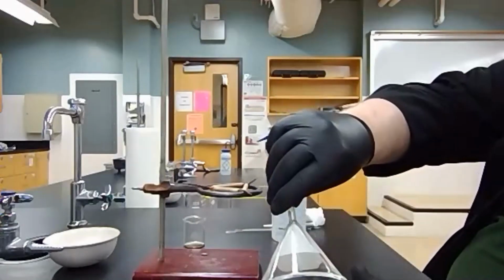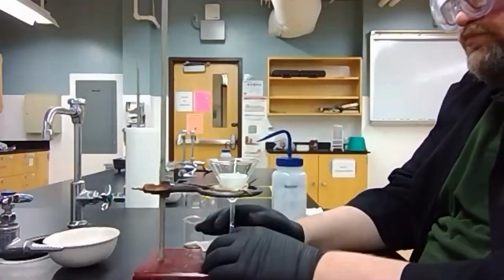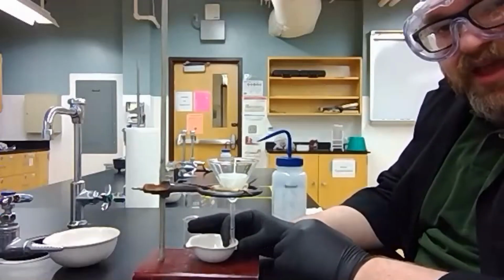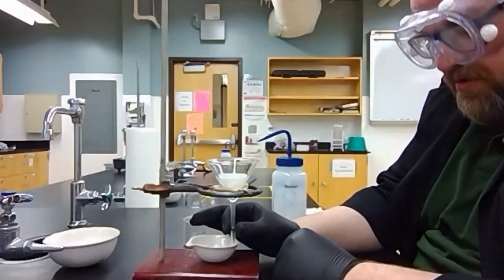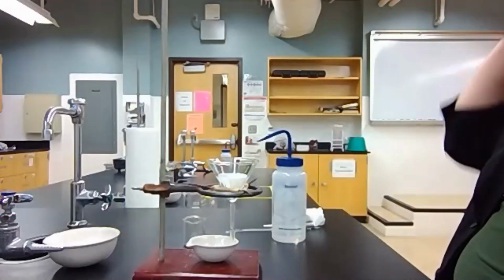Okay? Now, put it back down here. Place the funnel sitting against the edge of the evaporating dish about 2/3 of the way down. Okay? And now we're ready to actually start chemistry.